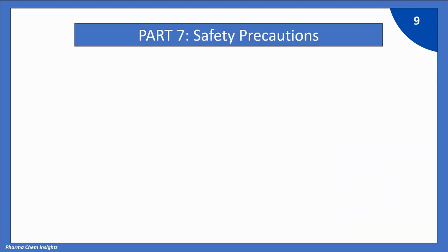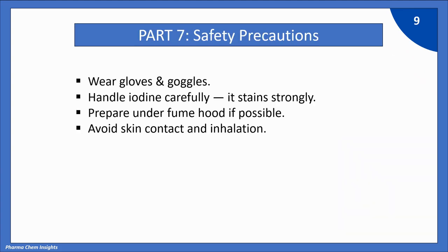Safety precautions. Wear gloves and goggles while preparing 0.1 normal iodine solution. Handle iodine carefully because it stains strongly. Prepare iodine solution under fume hood if possible. Avoid skin contact and inhalation of iodine.